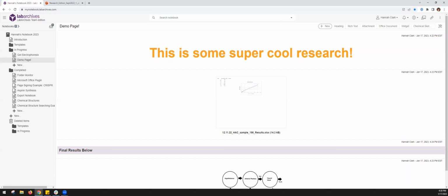It's a good question. So the date and time stamp that we show, top right here, will always be the date and time that it was put into LabArchives. So this is our trusted global time source date and time stamp. So there are cases where you upload this file, you can actually see it right here. I put this file in today, January 17th, but the name of the file says December 11th, 2022. In general, that's considered okay. Talk to your regulatory bodies, talk to your librarians, talk to your resources locally as to what they require.